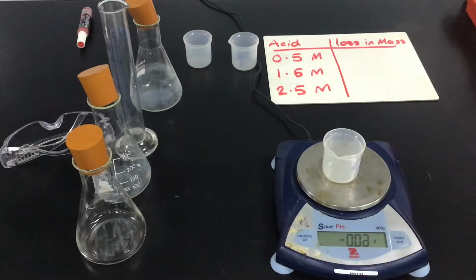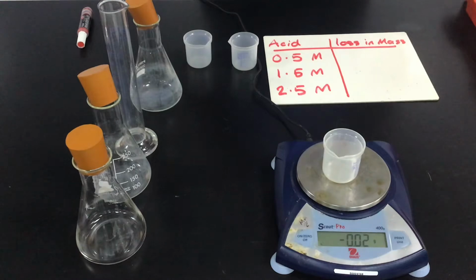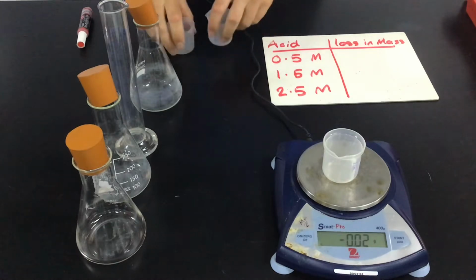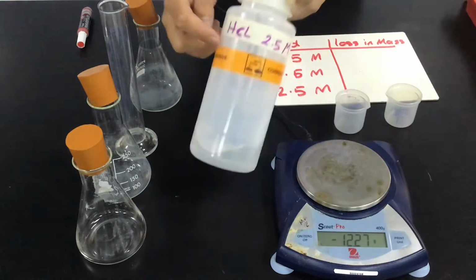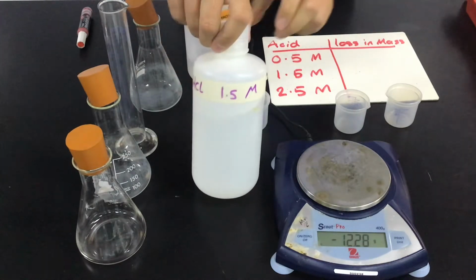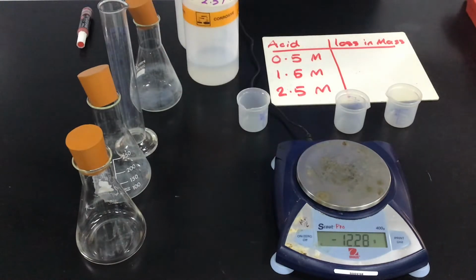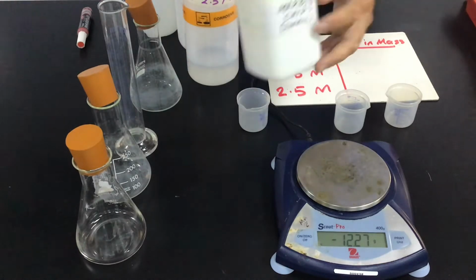Okay, this is our experiment. We are going to first off wear goggles because we are dealing with very strong hydrochloric acid. What we're going to do is react hydrochloric acid, HCl, of different strengths, so 2.5 molar, 1.5 molar, and 0.5 molar. We're going to react it with what we call marble chips, calcium carbonate, marble chips. I have selected the small chips.